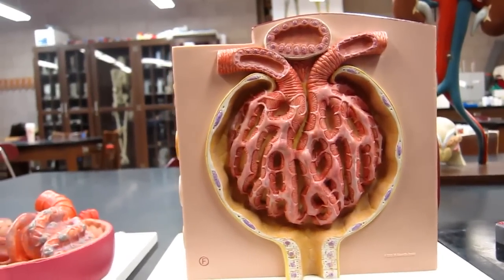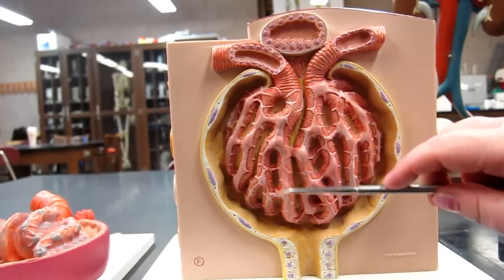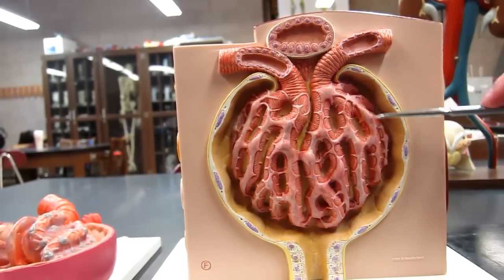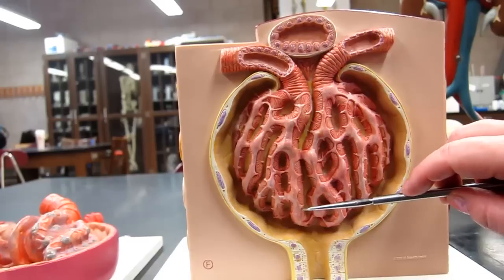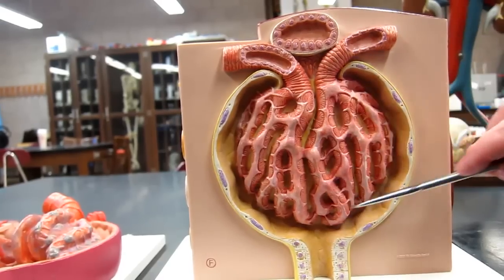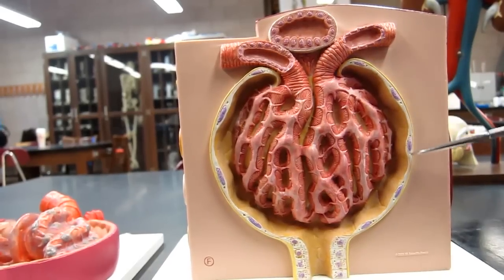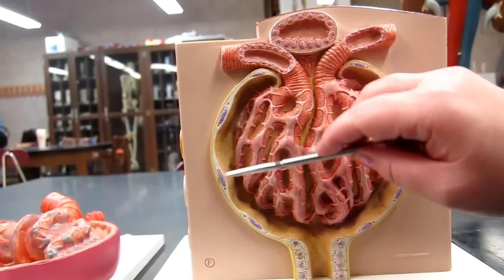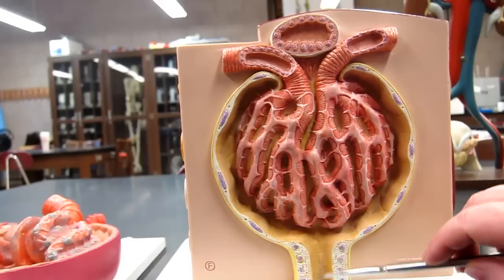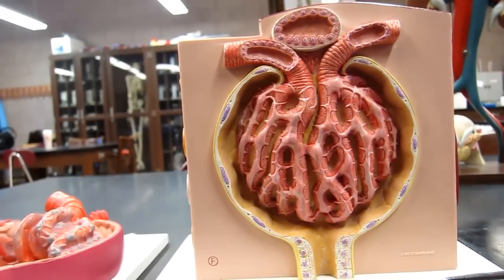Here's a huge enlargement of the glomerulus and the glomerular capsule. So you can see the glomerular capillaries, and this material that's kind of spread over them is the visceral layer made up of the podocytes. Okay, so afferent arteriole, glomerulus with the visceral layer of the glomerular capsule, efferent arteriole, here's the parietal layer of the glomerular capsule, capsular space, and then here would be the proximal convoluted tubule. Again, lots of microvilli on these simple cuboidal epithelial cells.